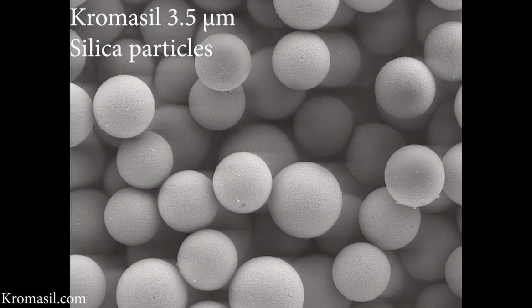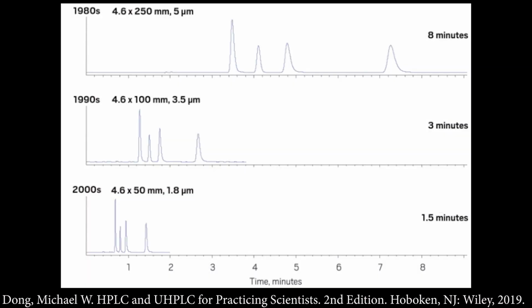They need to be homogeneous, nice spheres, and all pretty much the same size. That's going to give us a really nice separation. So you can see the difference here in these nice, fairly homogeneous, smaller particle sizes that we're going to use for analytical separations.